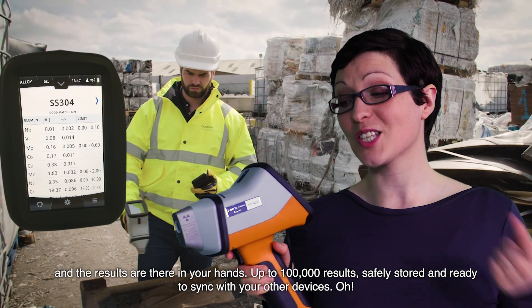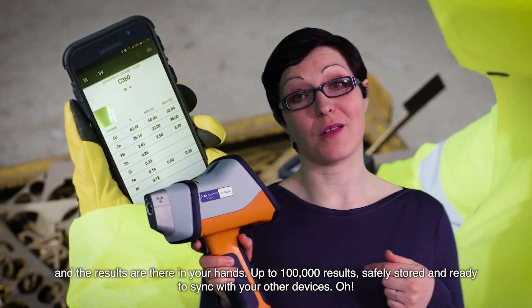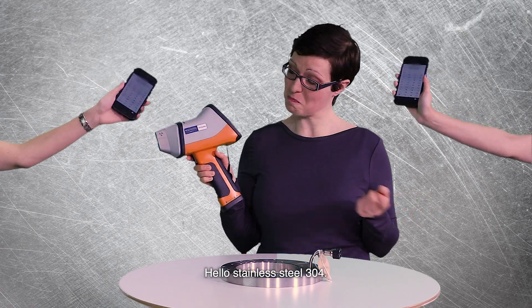Up to 100,000 results safely stored and ready to sync with your other devices. Hello, stainless steel 304. I've got your numbers.